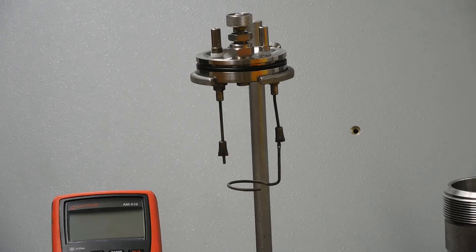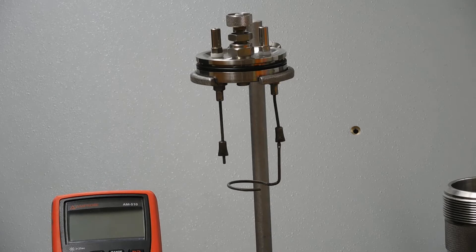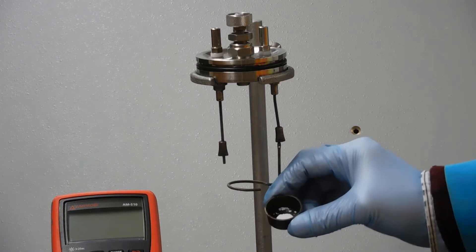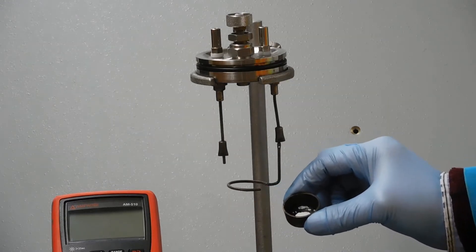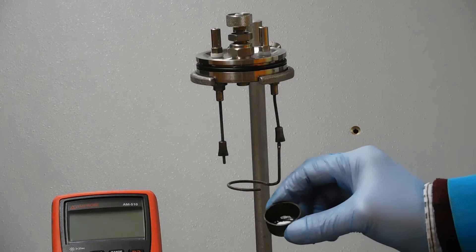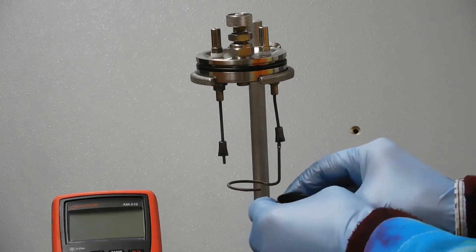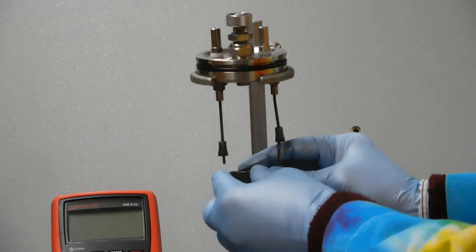In the previous video on bomb calorimetry, I showed you how to make a pellet. We got to the point of having made this pellet and put it in this little cup. This goes inside the bomb in this little holder here. The cup sits down like this.